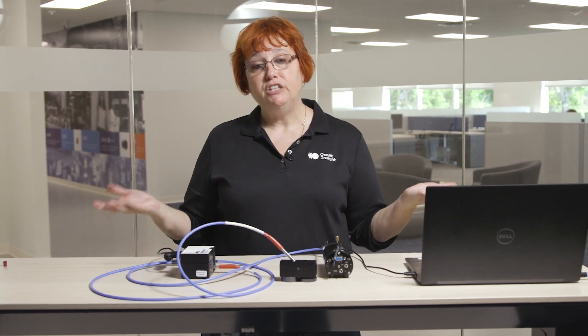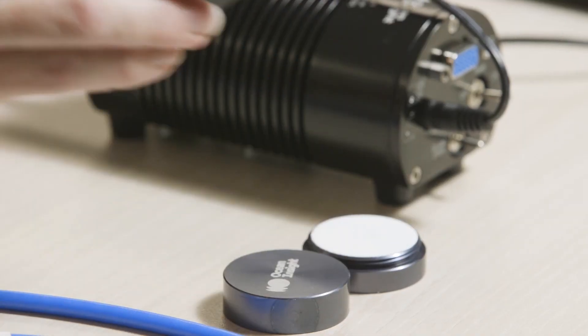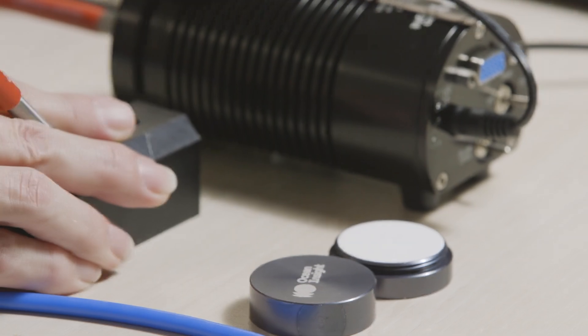We're going to open our shutter again so we're illuminating our reflectance standard. And for a standard reflectance measurement, we're ready to go. You've done everything you need to do. Now you're just going to place the probe onto your sample and collect your reflectance spectrum.